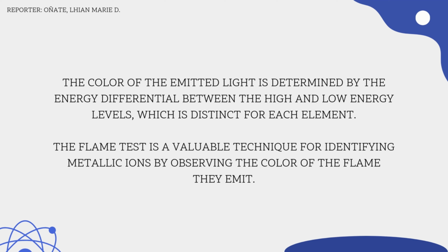For example, sodium ions produce a bright yellow flame, while copper ions emit a green flame. Additionally, this method is valuable because it quickly and simply identifies metal ions without the use of complex instruments, and it is also often used with other methods to confirm the metal's presence.